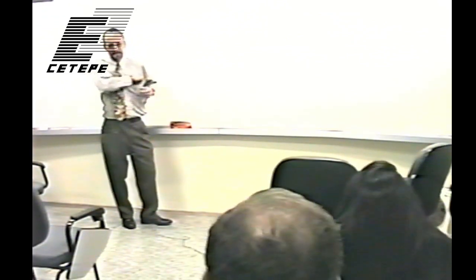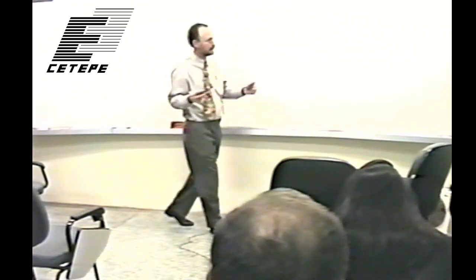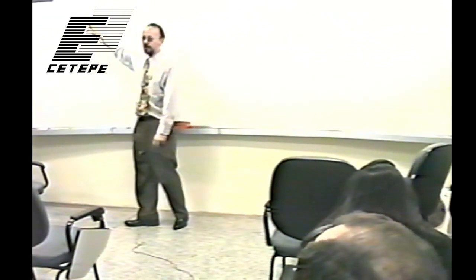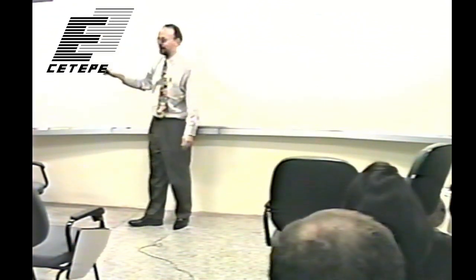One other thing I'd like to say about film, because there are two other things, but they're both embodied in the same graph, is this kind of input-output relationship, which in the case of film is called the H&D curve. And this stands for the names of two Germans, Hurter and Driffield or something. It took me a long time to find that out, but you just call them H&D curves. So this here would be the optical density, which most people call OD.